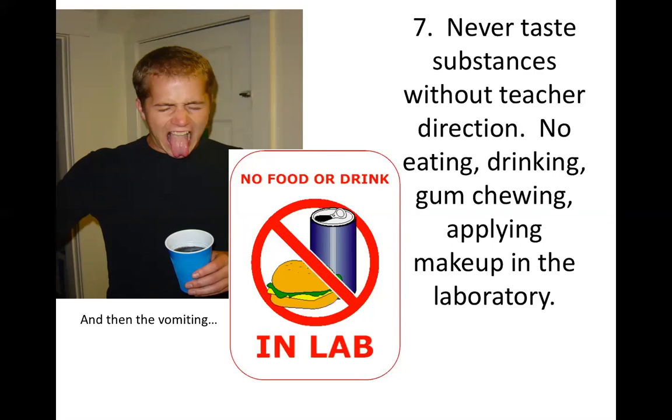And the proper way to taste chemicals in the laboratory is that you place a small amount on your tongue, but you do not swallow it. You have to spit it out. So once you taste it, you spit it out. Okay? And then the second one is one of the most important.